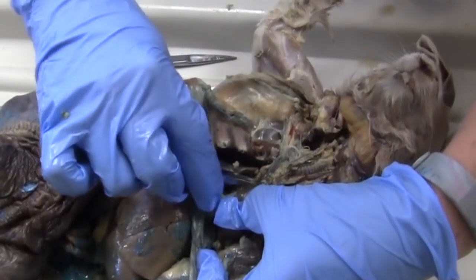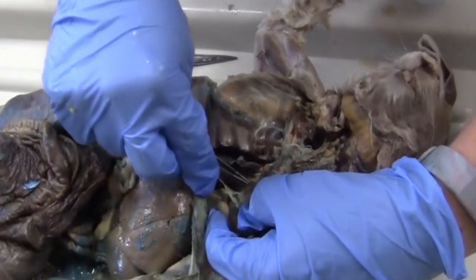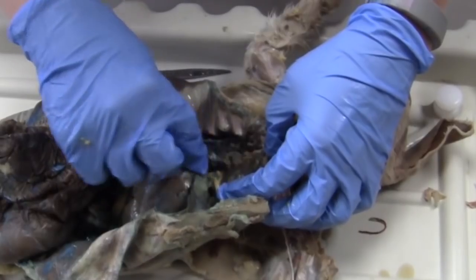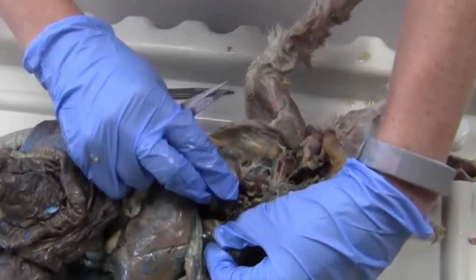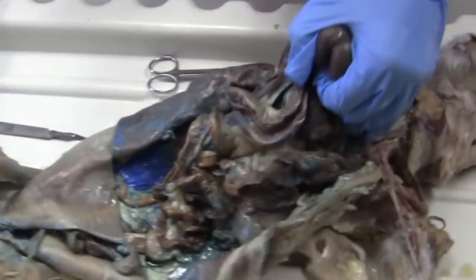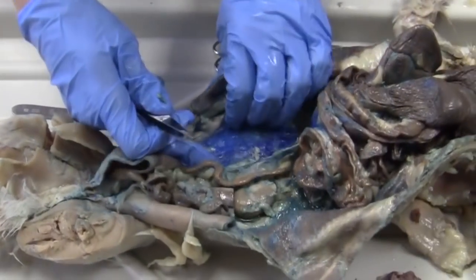And then just below that, I'll have the caudal vena cava, also coming into the right side of the heart as well. And on the back side of the heart, so cranial vena cava, caudal vena cava. Or obviously, if you guys want to look down here to the bottom of the rabbit, the caudal vena cava is the one that exploded back here.